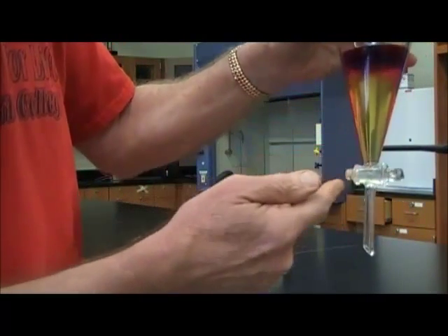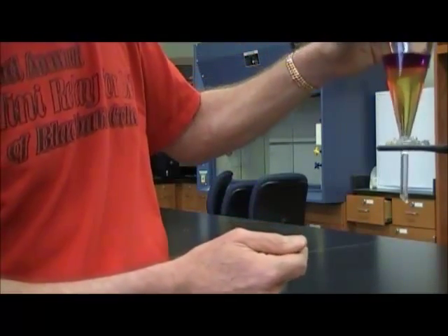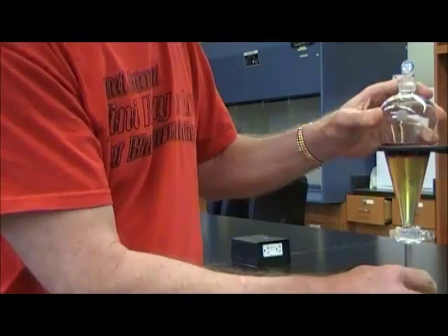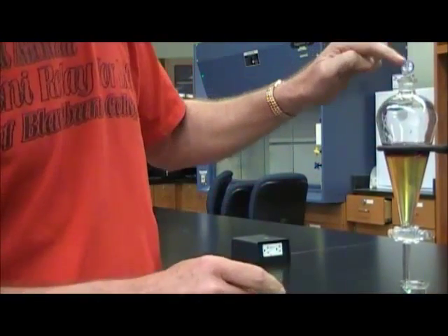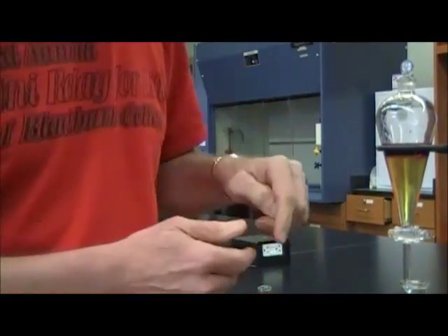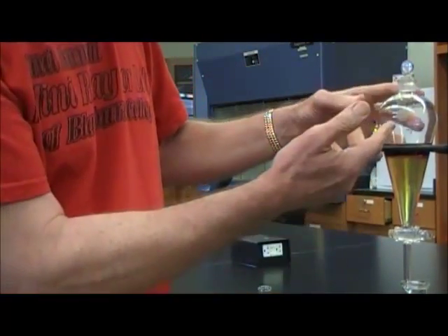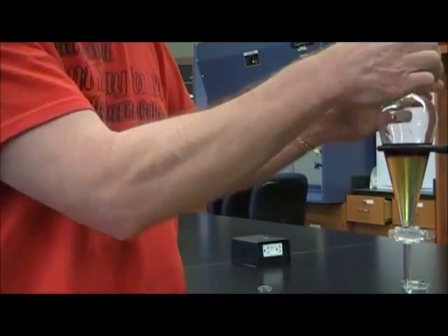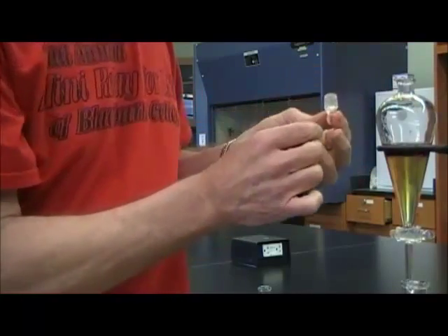I'm going to go ahead and drain out some of the bottom layer into a separate container. Now, when you do that, one thing you have to do is take the stopper out. If you try to drain it with the stopper still in there, there's no way for air to get inside, and the pressure will decrease inside as the liquid is draining out. You don't want to do that. So, just take out the stopper.